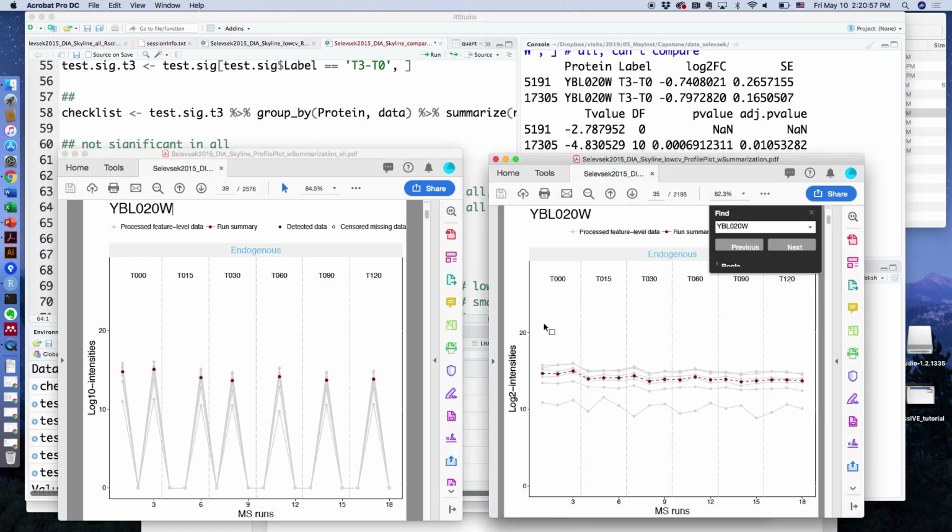Yes? Why are the profiles different? So, let's go back to what we practiced with Brandon just before this session. For that specific data set, he processed it two different ways. One is just going through whatever he did. The other one, he already had some other MS1 information, and from there he found some features which were noisier, with higher CV. Then he removed those specific features from the data set, and then calculated and quantified it. So the total number of features can be affected in several different ways, by the quantification itself, or calibration, or the Q value calculation, FDR. So that's why the output quantified value differs.